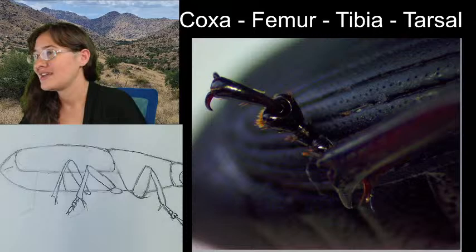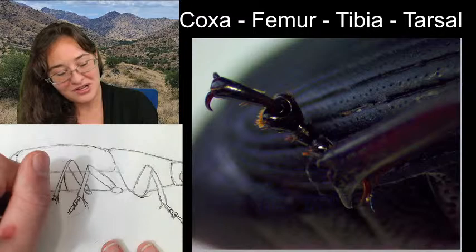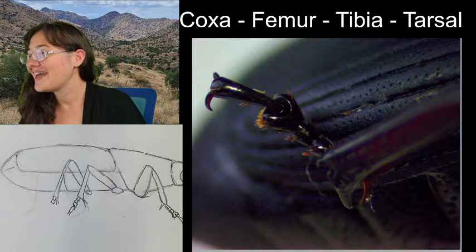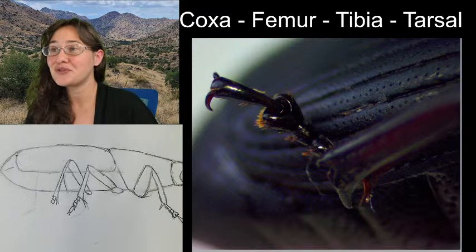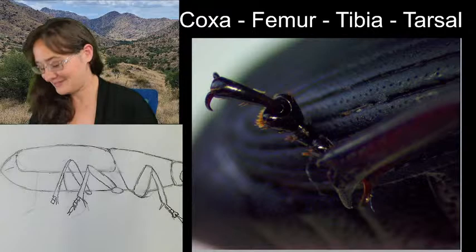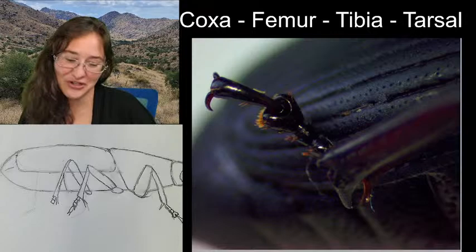He does have pretty feet. Oh, he makes me so happy. So we have one, two little itty bitty segments, and then they're so specialized. Yes. And then you can talk about niches, and microhabitats, and an entire food web just with insects if you wanted to. He even has orange foot fur. Yeah, I was saying that it was kind of gold, but I guess it could just be orange, too.